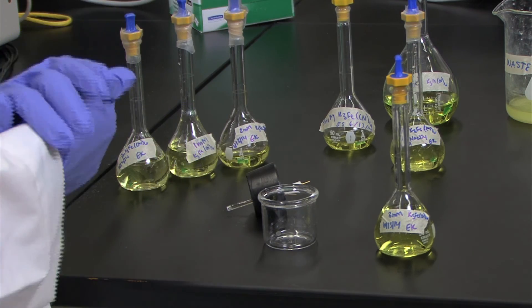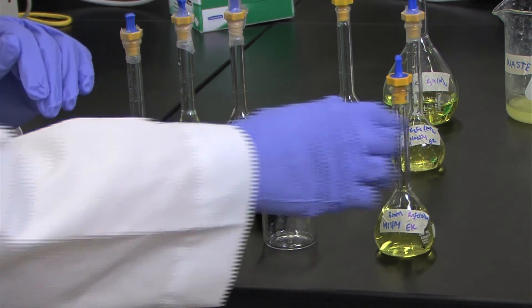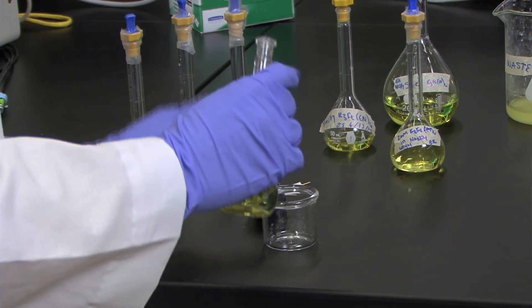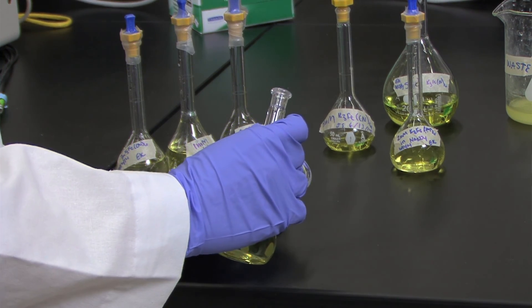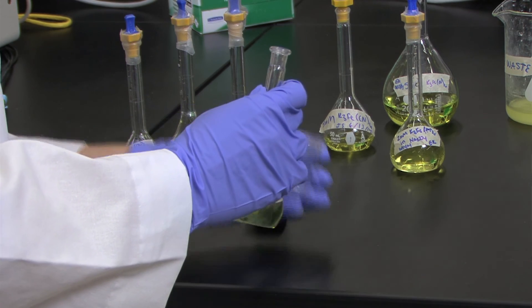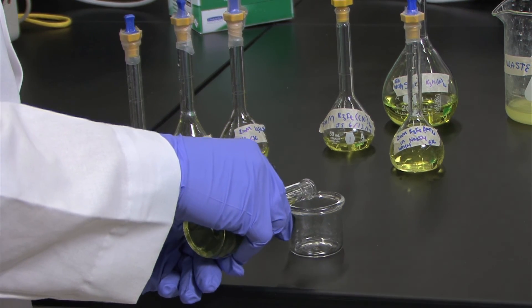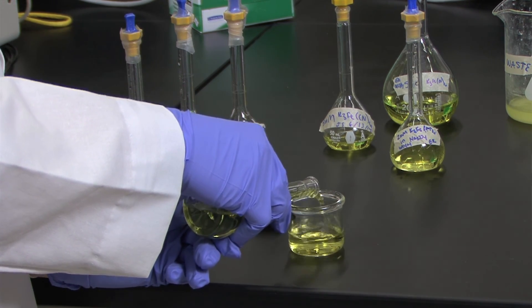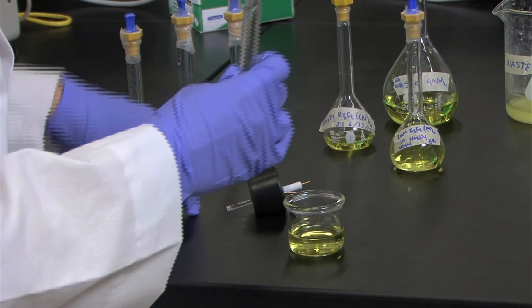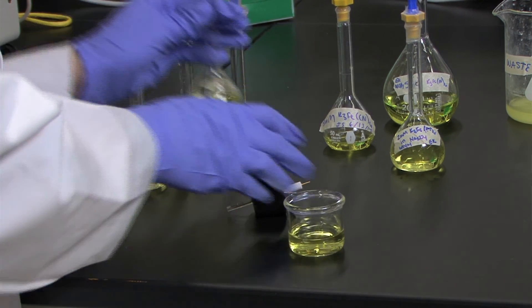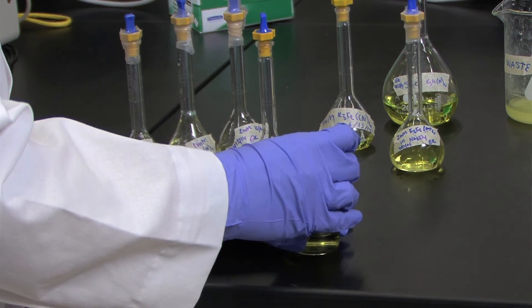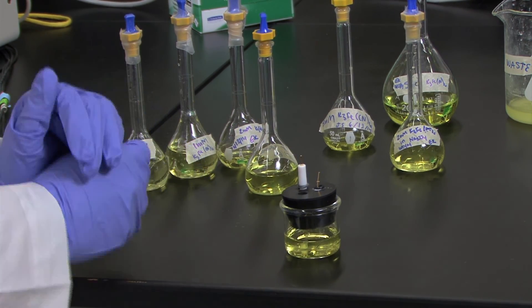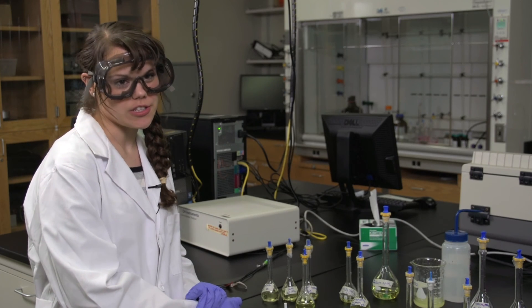Once you've finished preparing all your solutions, you're ready to collect your first measurement. Take your solution and pour it into a clean, dry jar cell. You want the volume to be about halfway so that when you stick the stopper in with your electrodes, the bottom of the electrodes are completely submerged in the solution. Once you put your stopper on, you can walk over to the hood to begin purging.